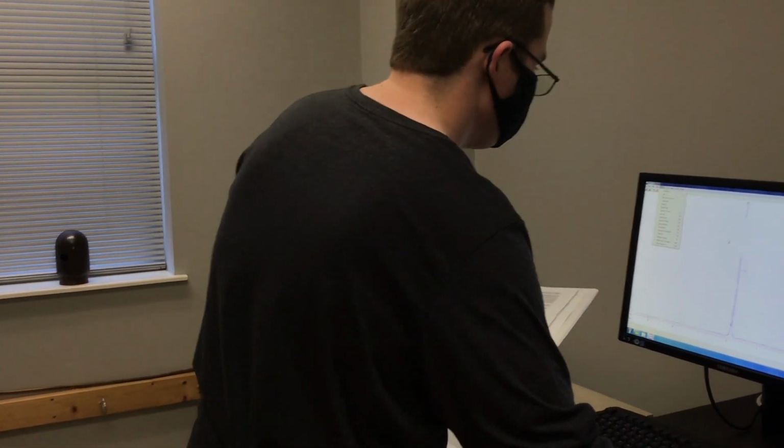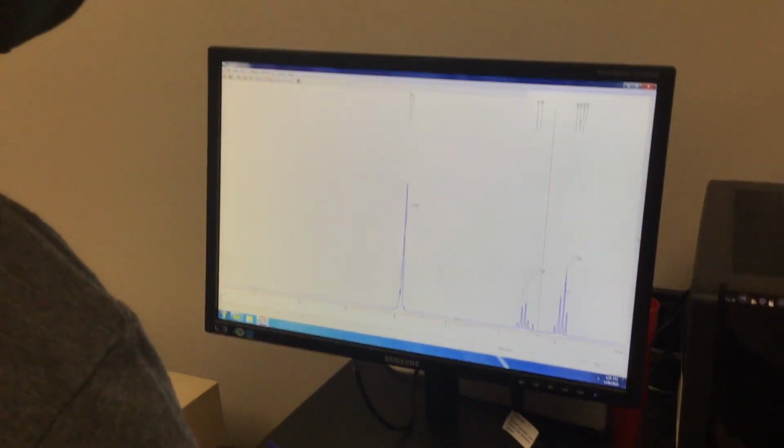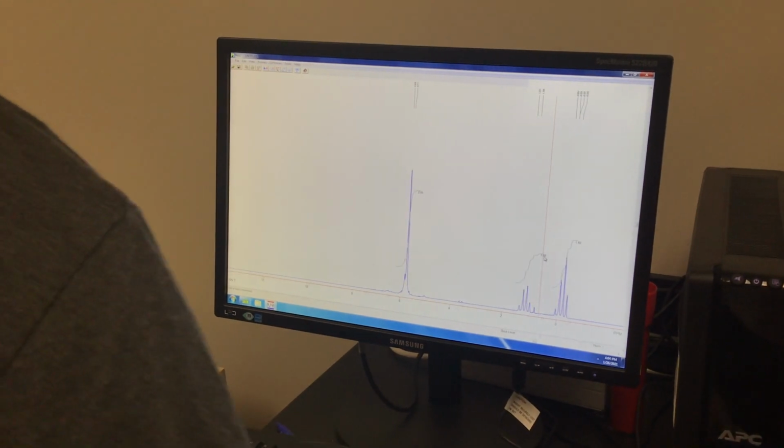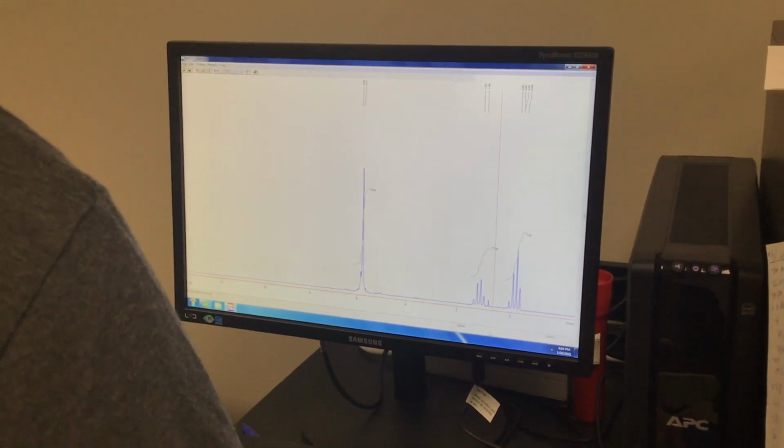All right. Let's see. That or here too. Go back to process and pick integrate display again. Let's see if I hover over this right there and hit V. Maybe I double click it. Maybe hit V. Maybe not. We'll see.